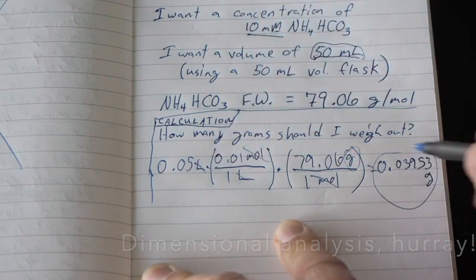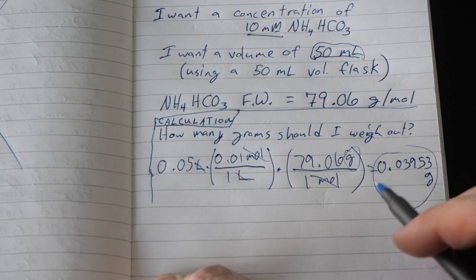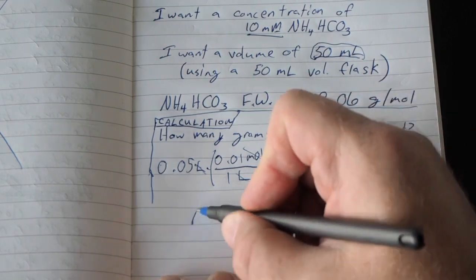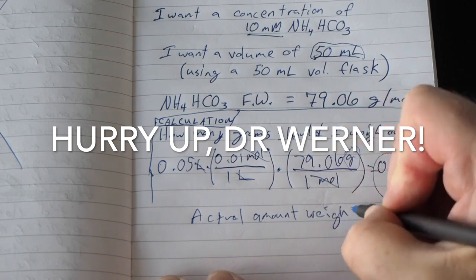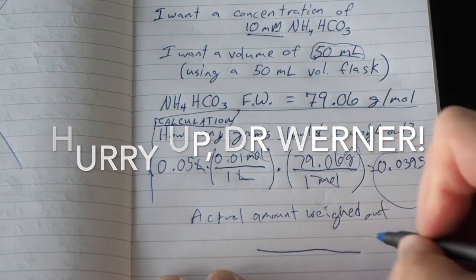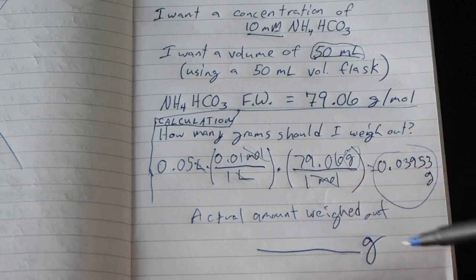All right, so I need that many grams. That's not actually, there's way too many sig figs here. That's not actually how much I'm going to weigh out. So I'm going to write down how many grams I actually weigh out on the balance.